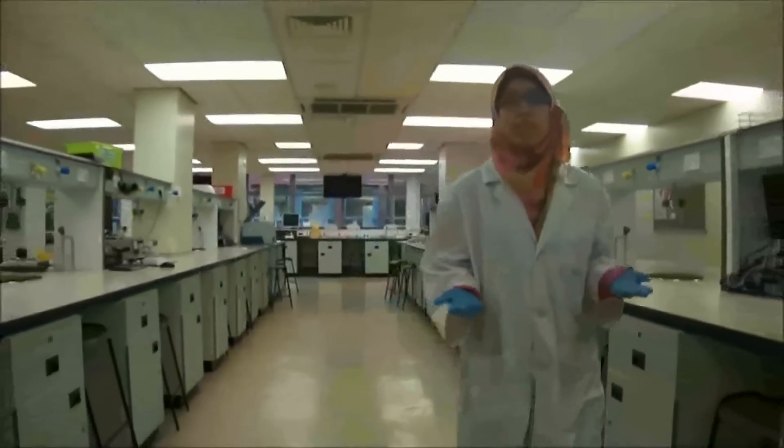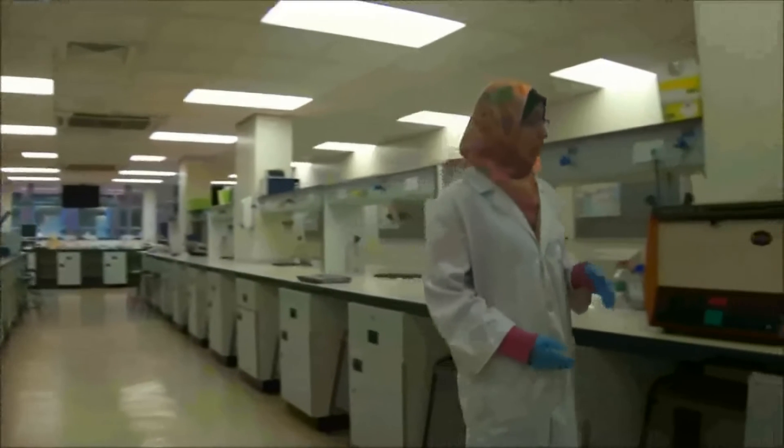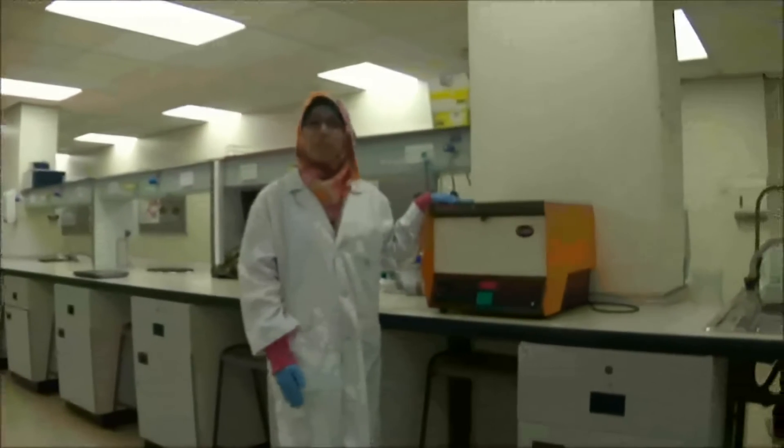We have different types of centrifuges to do this, but today we'll be talking about how to use the benchtop centrifuge.